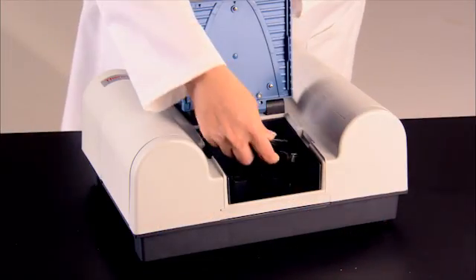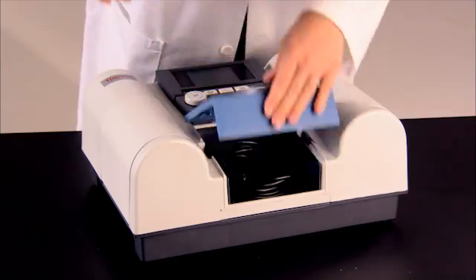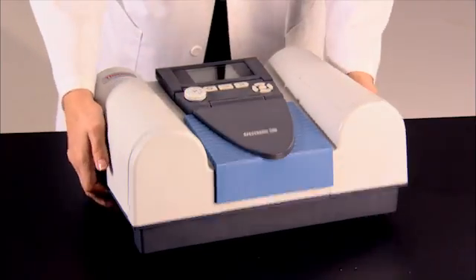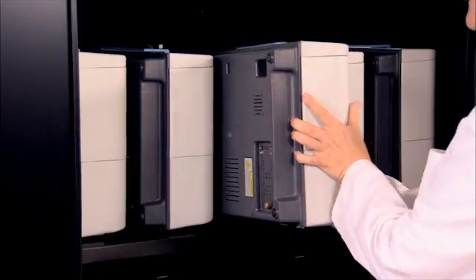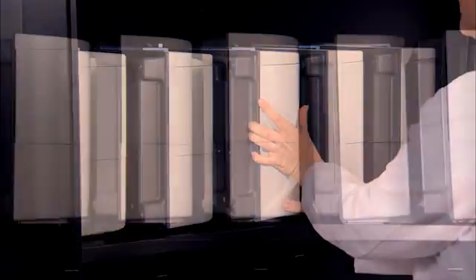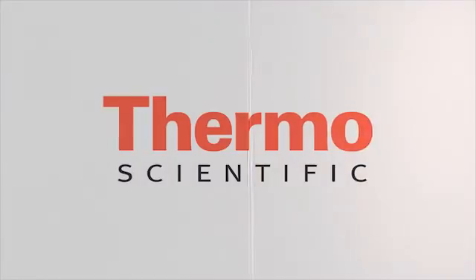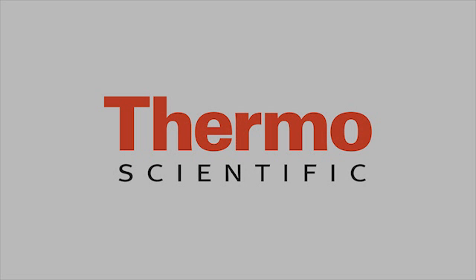The Thermo Scientific Spectronic 200. With the experience gained from over a half million SPEC 20 customers, the SPEC 200 will become the new standard of the 21st Century Teaching Lab.